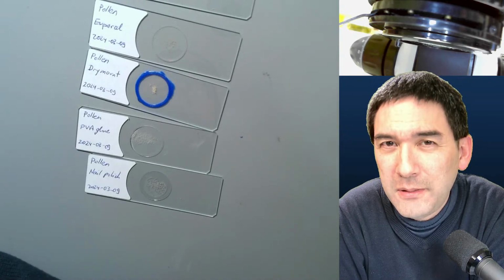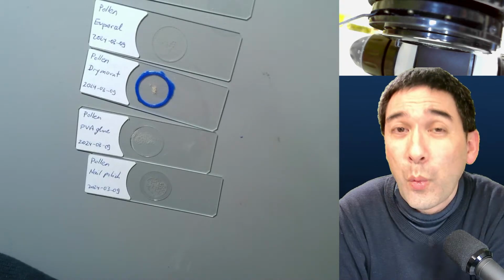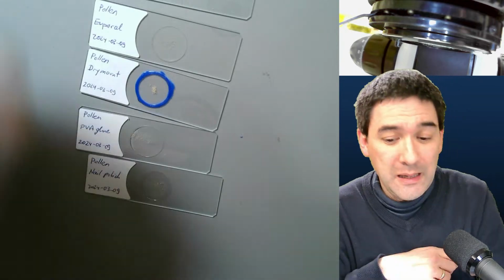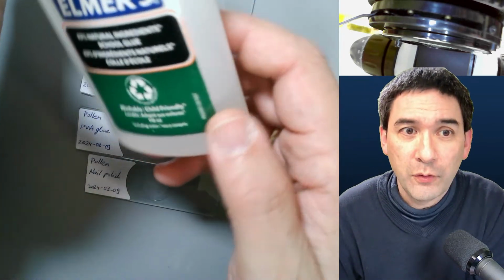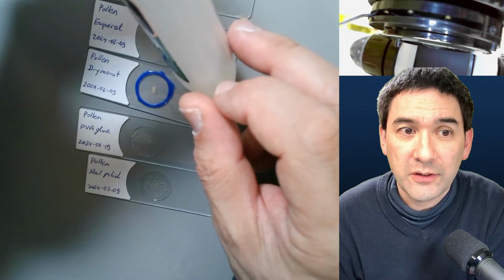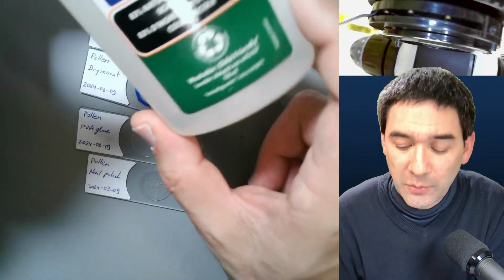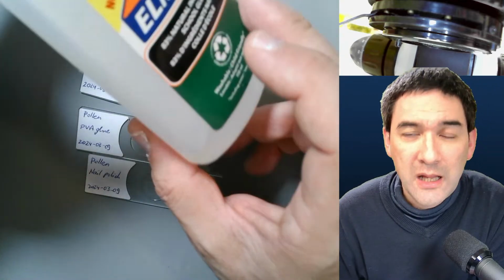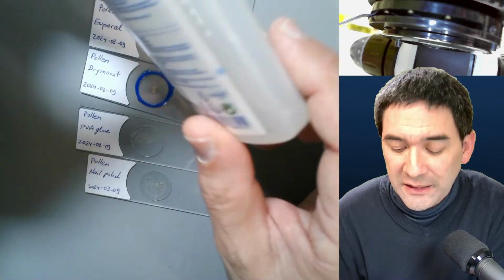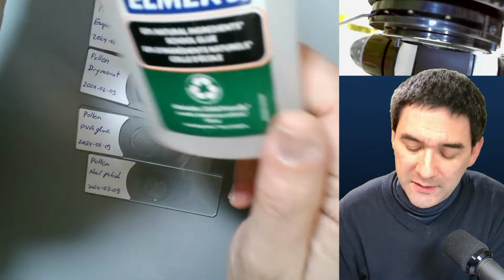PVA glue comes in the form of a white glue, like wood glue, it's called PVA glue, but this glue that I have over here is completely clear and transparent. And that's the one that I'm using. I added a little bit of water. I took out a sample into a separate container, mixed it with a few drops of water to thin it down a little bit.